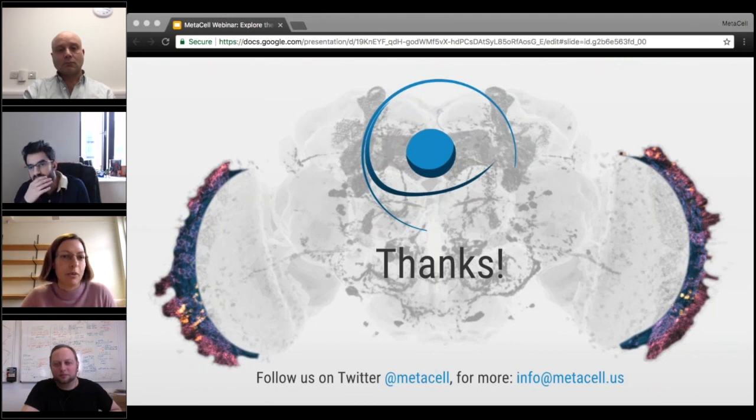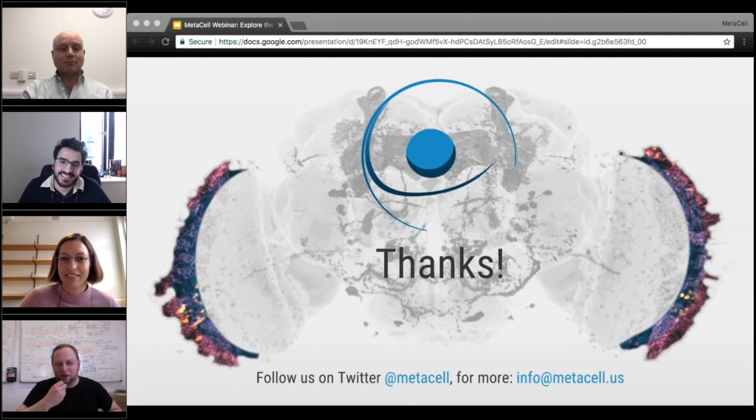When you're doing bulk data and it's thousands of images, then it's helpful to have more computing time. But Rob has been doing that in Edinburgh as well. If you've got a desktop machine, you're probably talking about 4 to 8 hours to do a normal alignment, depending on how much it has to adjust. But it's doable. Basically, if you want to leave it overnight, you can do it on desktop machines.